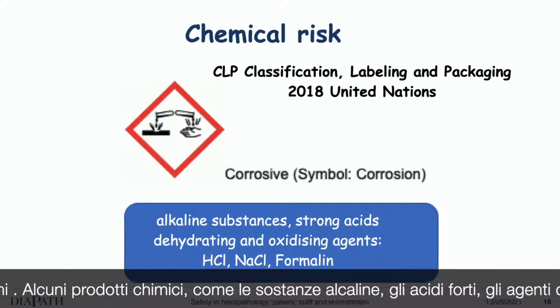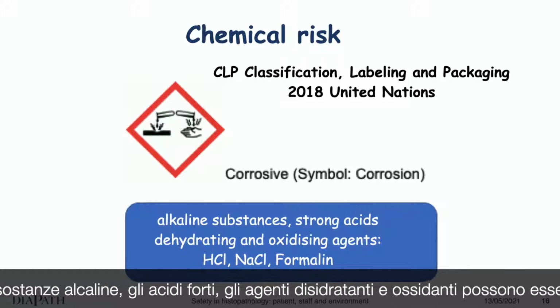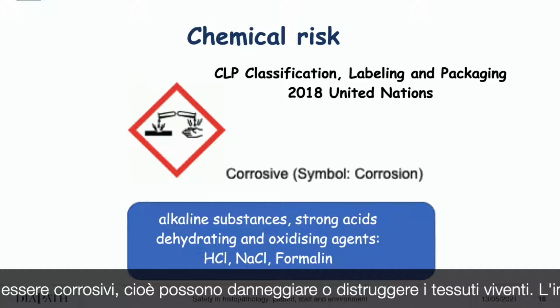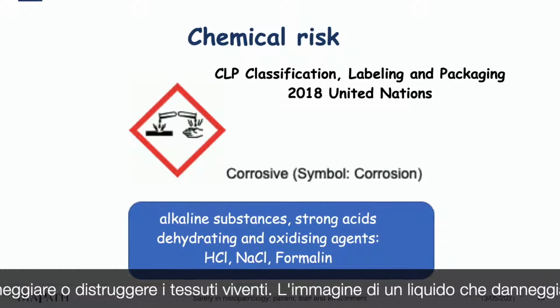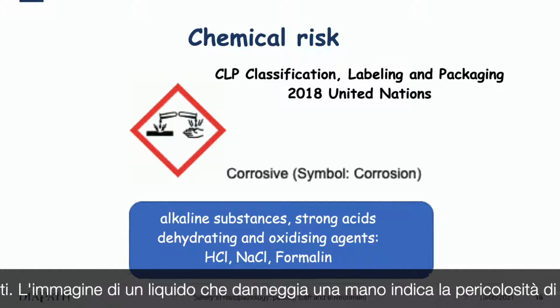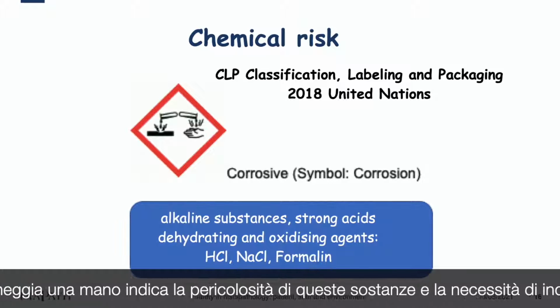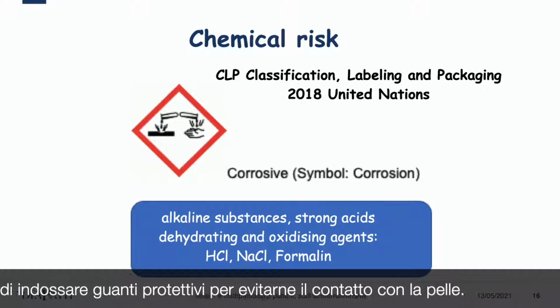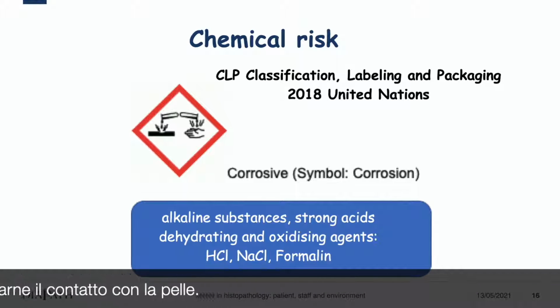Some chemicals, like alkaline substances, strong acids, dehydrating and oxidizing agents, can be corrosive. That is, they can damage or destroy living tissues. The image of a liquid damaging a hand indicates the hazard of these substances and the need to wear protective gloves to avoid skin contact.